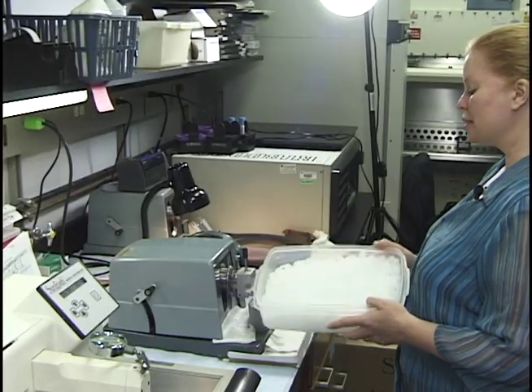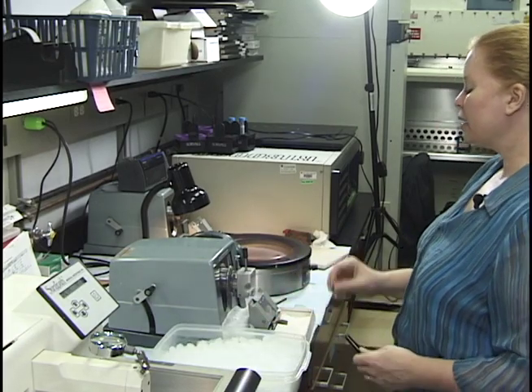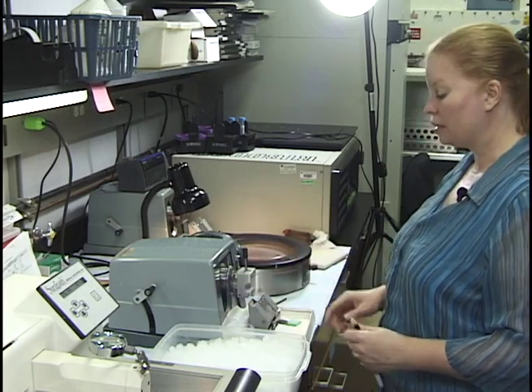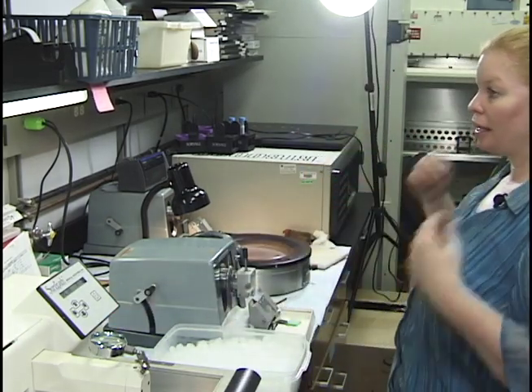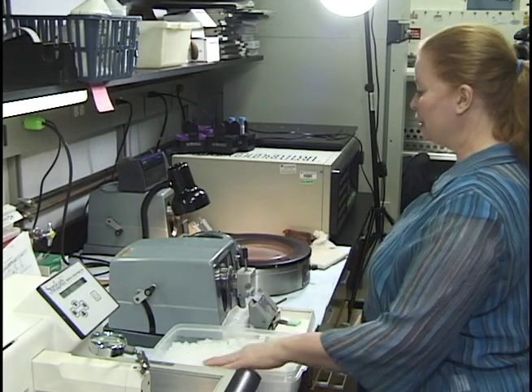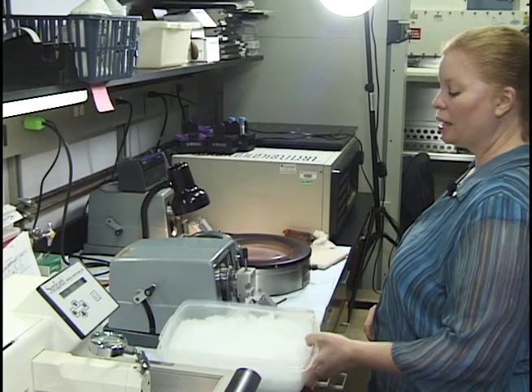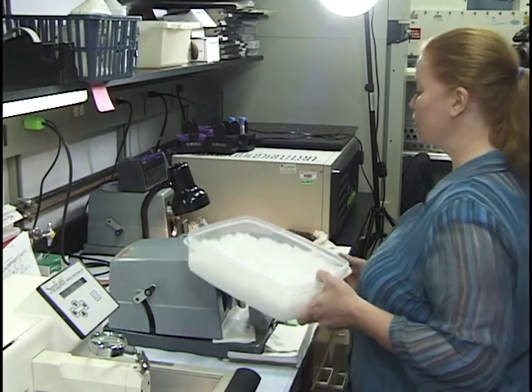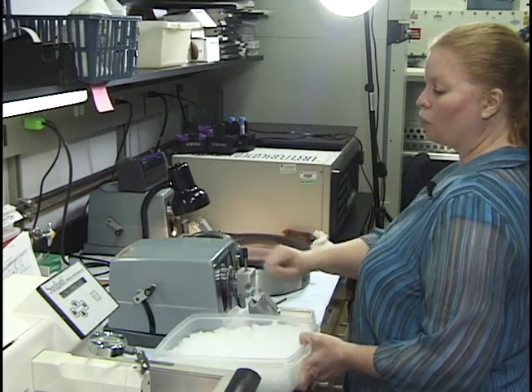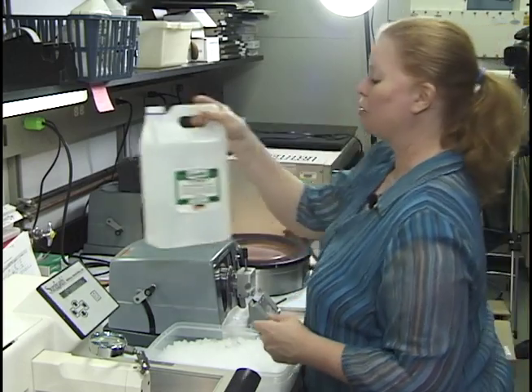This is a container of crushed ice, and I use that for after I face the blocks. I actually put water in it as I face the blocks and put the blocks in. For the organotypic cultures or epidermal equivalents, they tend to like quite a bit of soaking. It's not that they're dry, they just cut nicer with less chatter and stuff like that. So I face probably 20 or 30 of them, and one at a time get them lined up in this water soaked ice. For now, I'm not going to put the water in it because I have some more things to show you, but I just wanted to show you. I go down to the machine and get the crushed ice. You can use ice cubes, you can use a frozen tray of ice and put water on top of it, whatever your decision is. That's why I was saving this extra water from the water bath and filled this container up all the way.